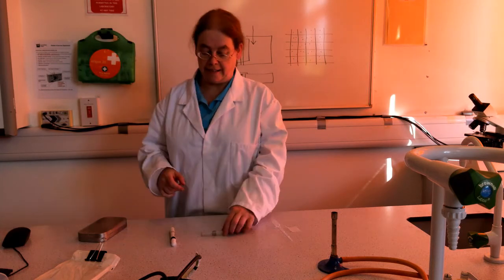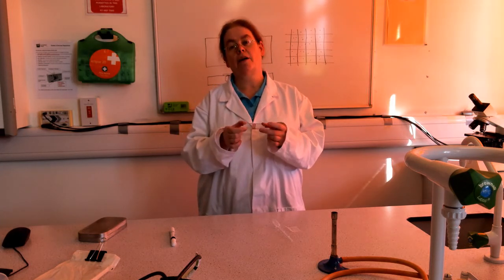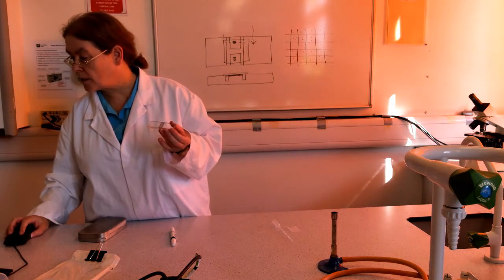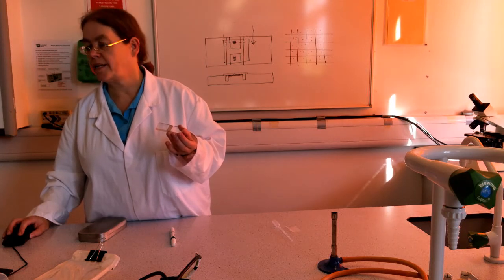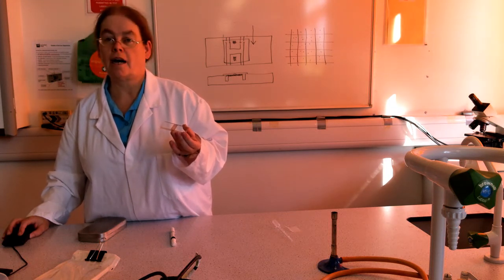Okay, I know, as I say, there's not a lot you can see from that distance. It's something that's better to learn by doing, but this is probably the best. I suppose if I take the focus lock off and come around there and point the camera at it, it's just possible the camera will pick up the haemocytometer. I'm not holding my breath.